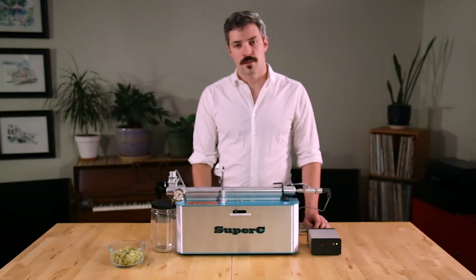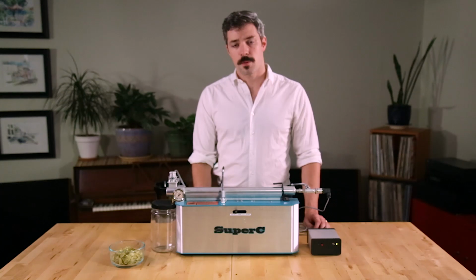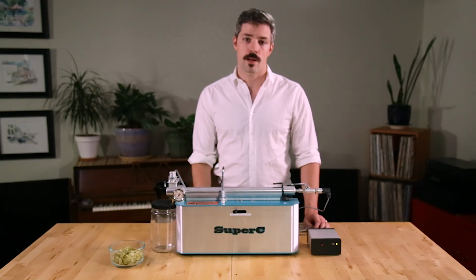I'm Chris with OCO Labs, and in this video we're going to be performing an extraction with the SuperC tabletop CO2 extractor. There are a number of materials which can be processed via CO2, and today we're going to be running hops. A couple of notes about your material.